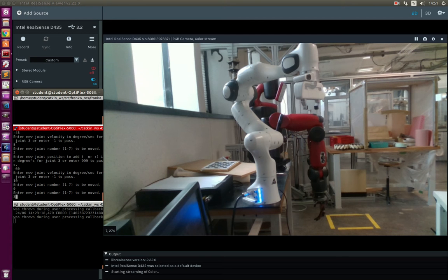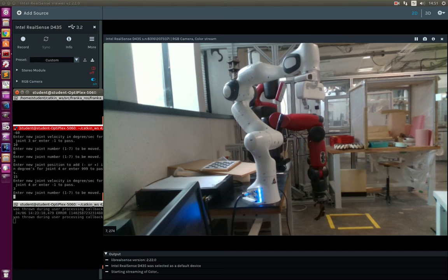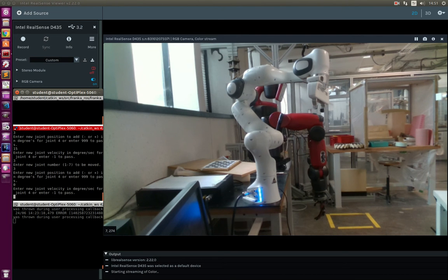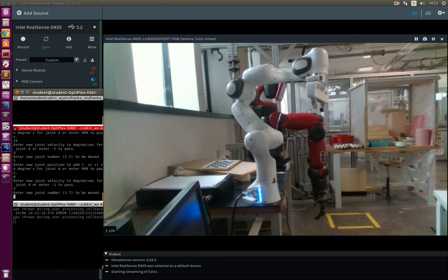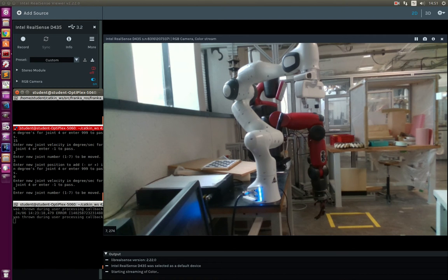Now sending the third joint to 15 degrees with 3 degrees per second. Not much problem. Sending the third joint to 0 degrees with 5 degrees per second. A small oscillation happened — it may not be very visible, but you might be able to hear it.